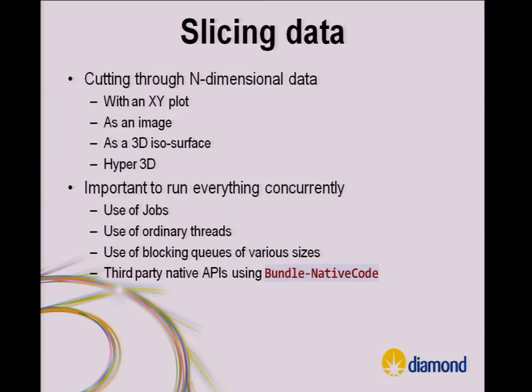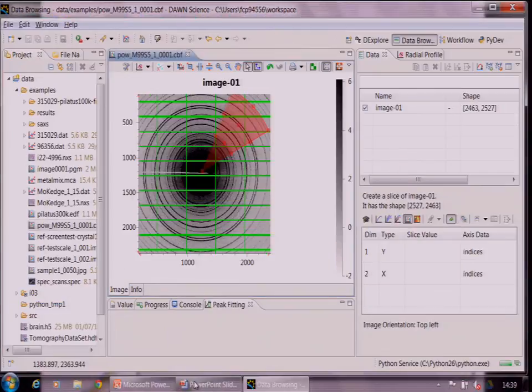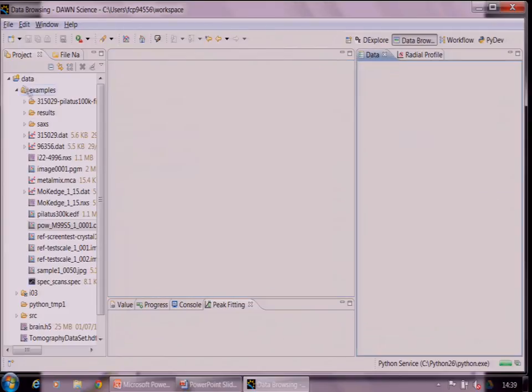So they write a lot of images. Rather than having directories crammed full of images, we're moving to this HDF5 format I mentioned, and we're trying to make multi-dimensional arrays into single files. I'll show you some cool stuff.